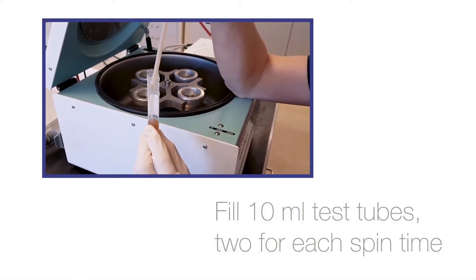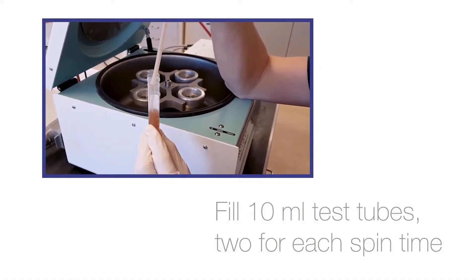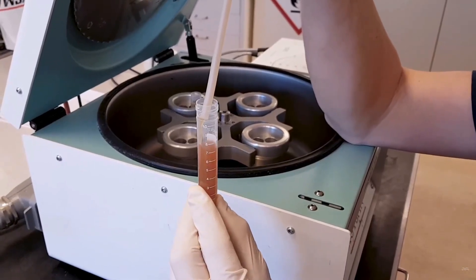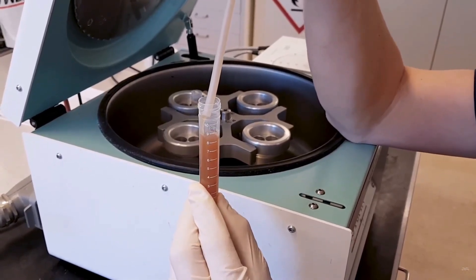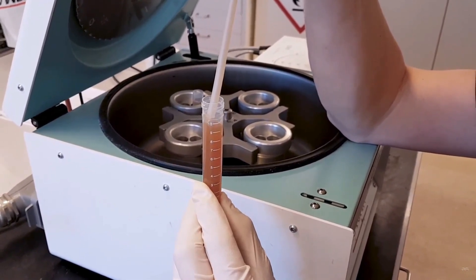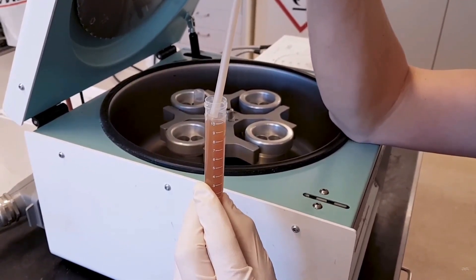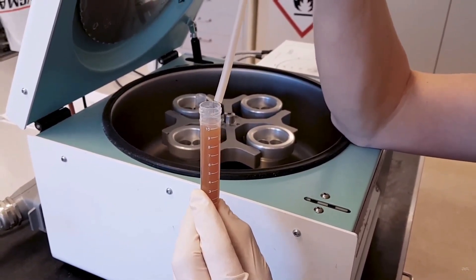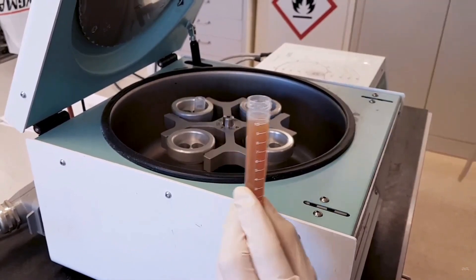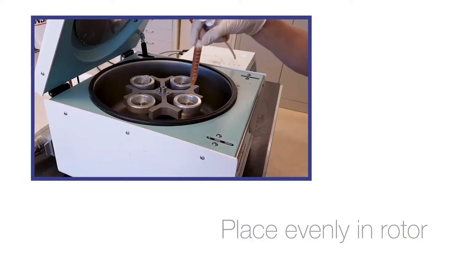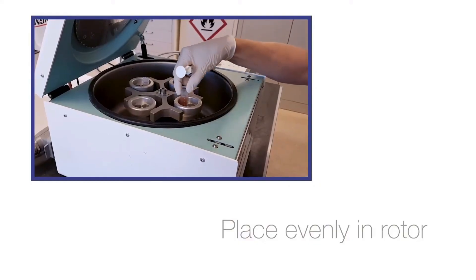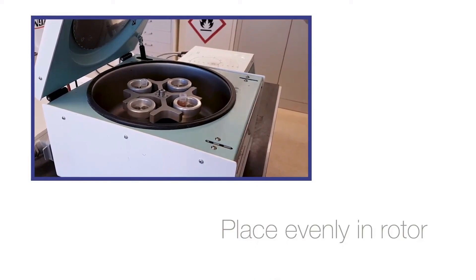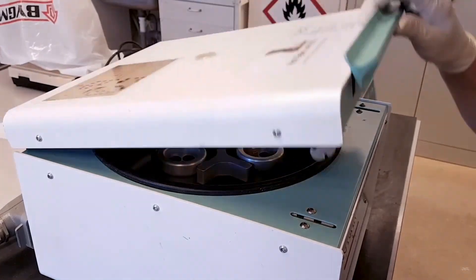You then place both vials into the lab centrifuge which you run at the desired speed and time. We normally recommend to spin between 2 and 60 minutes as these settings are the most representative when scaling up the results to full scale.